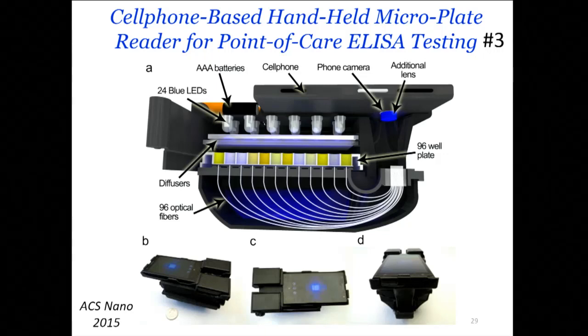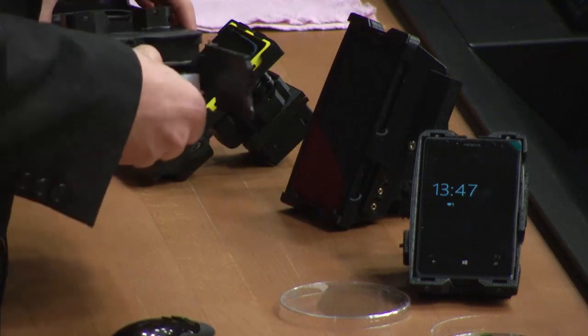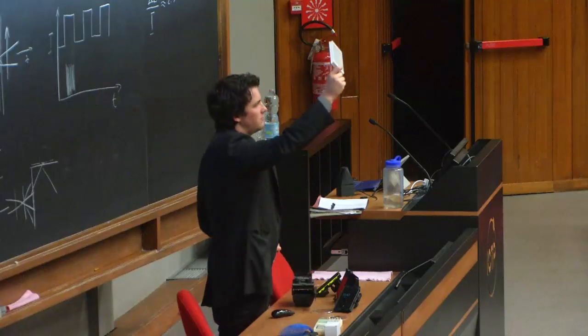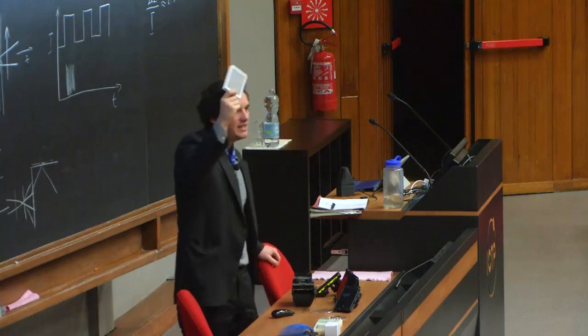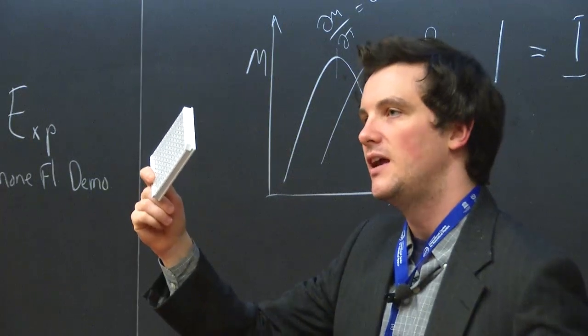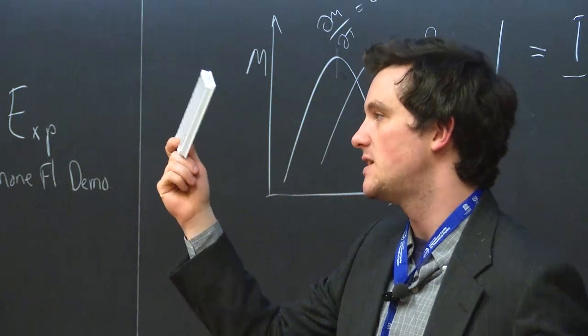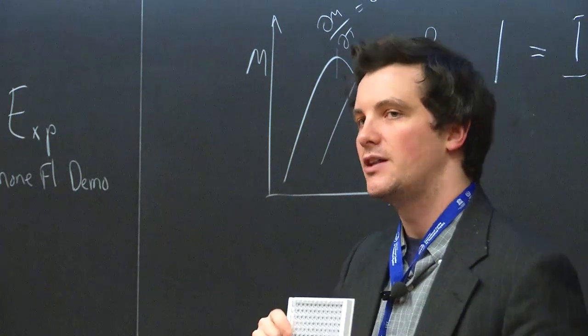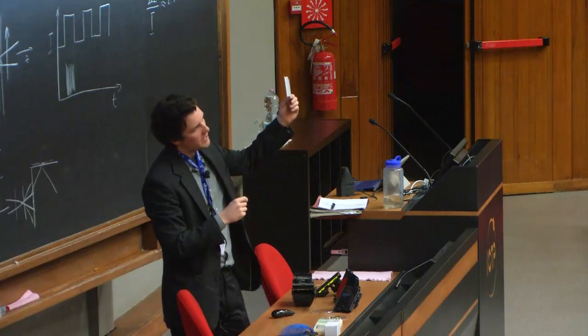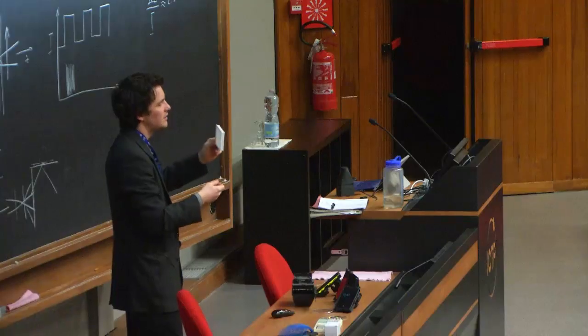And then the third device that I haven't talked about yet is this ELISA well plate reader. This reads an ELISA well plate, which is a plastic device that is very commonly manufactured. It has 96 wells for doing testing, so it's very high throughput biological testing. Typically, these are color-based tests. So you place a sample in here with other reagents, and the color in the well will change based off of the concentration of the biomarker you're wishing to detect.